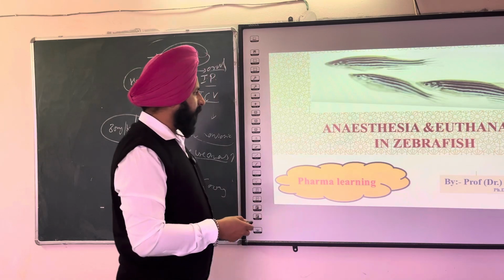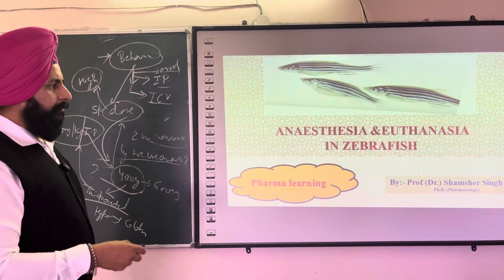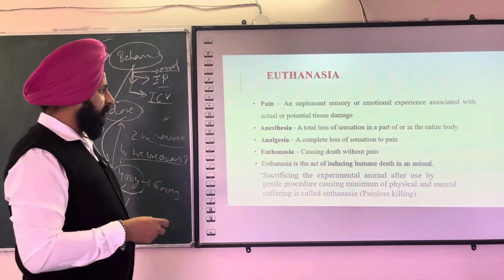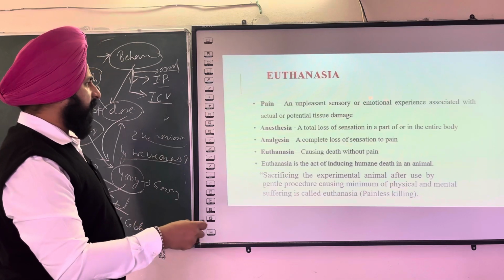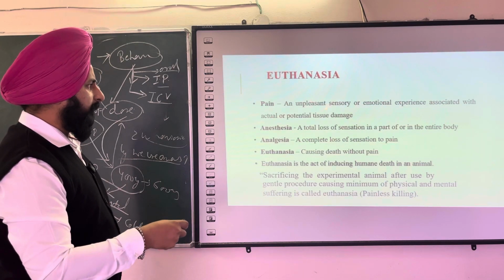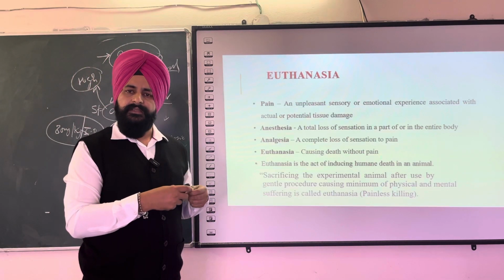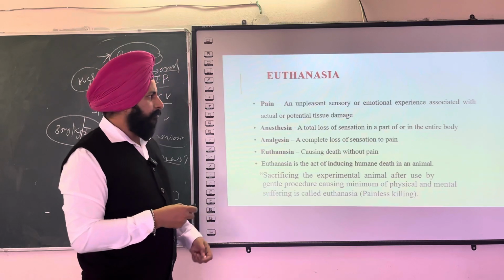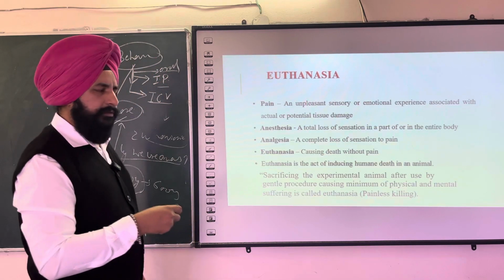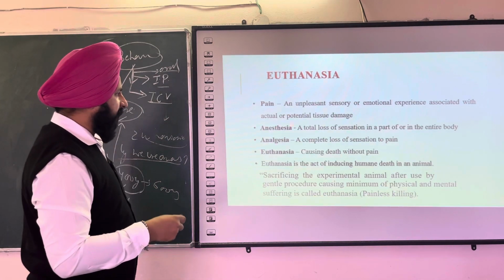So I will discuss which types of anesthetic and euthanasia techniques are preferred in the zebrafish. The first thing I have already discussed: pain needs to be avoided, because causing pain to the animal is against ethics. So we should reduce the pain by using these types of anesthetics.